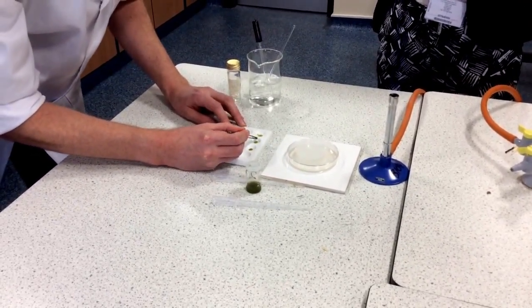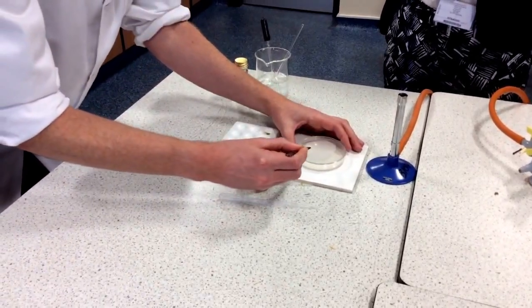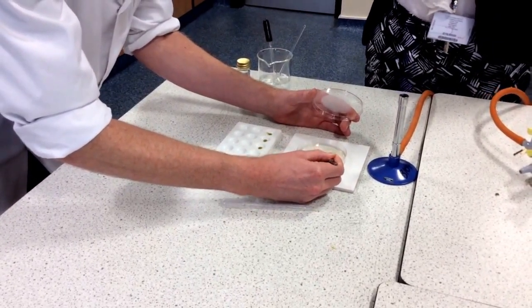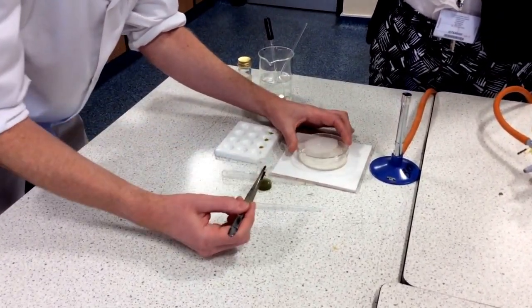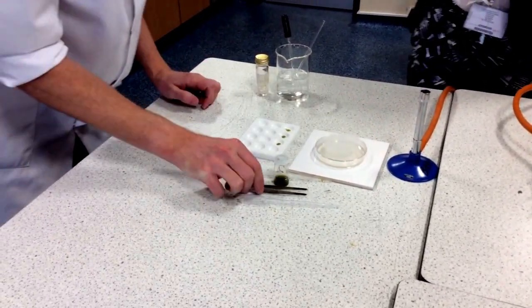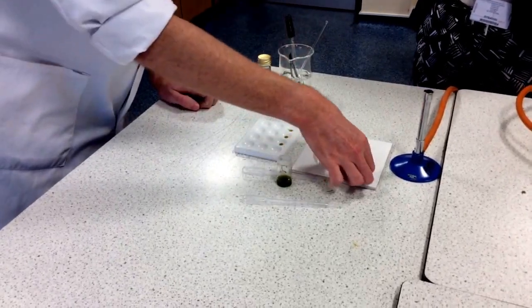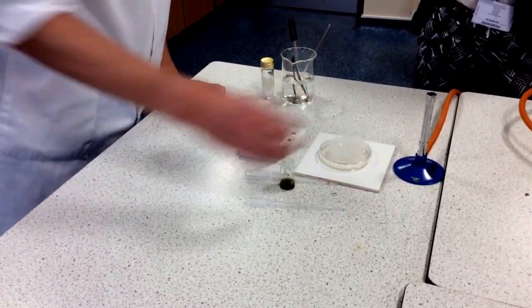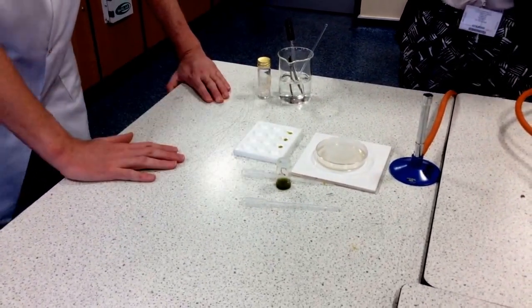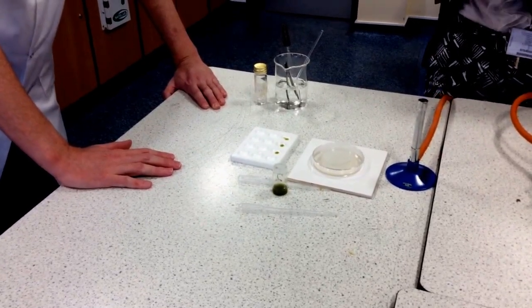I'm going to take my soaked paper disc, lift the lid of the bacterial lawn, and place the paper disc right in the centre, then put the lid back on. I will be sealing that up with sellotape and leaving it in an incubator to incubate. Another group will continue with the remaining plant extracts.